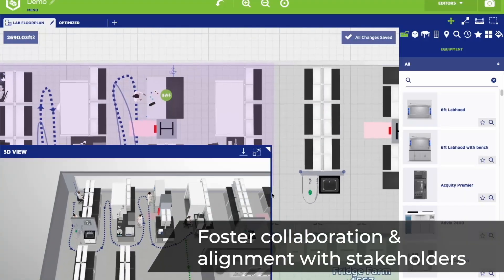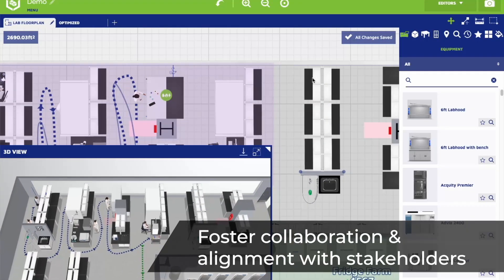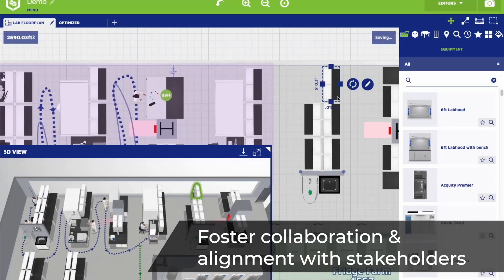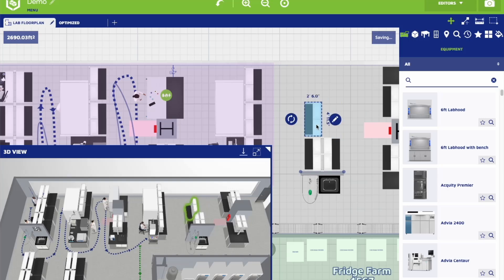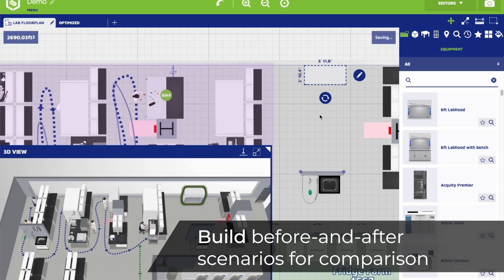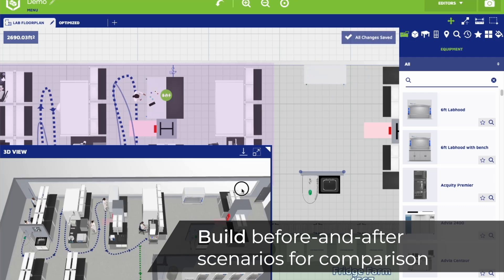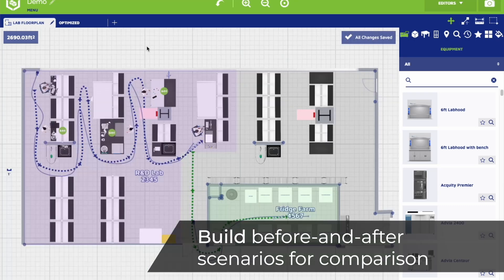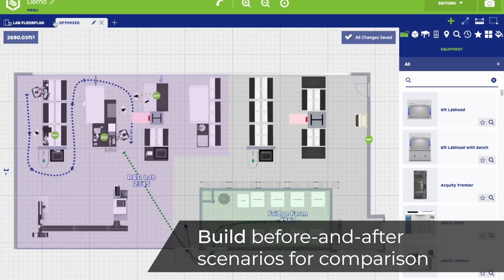Make informed decisions together. Quickly prototype and validate ideas. Adapt lab spaces with confidence. Visualize changes before committing. Compare, refine.